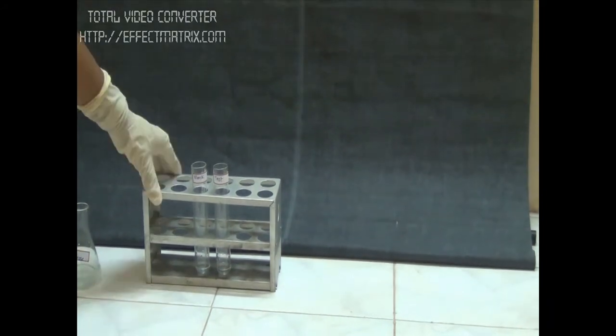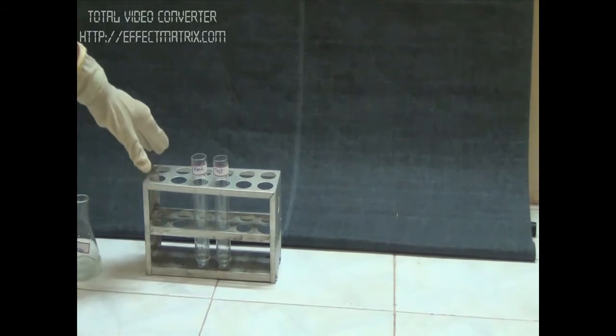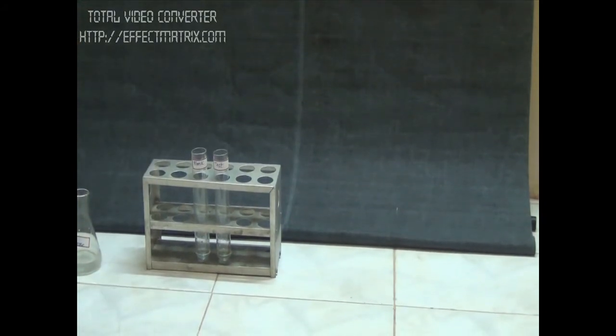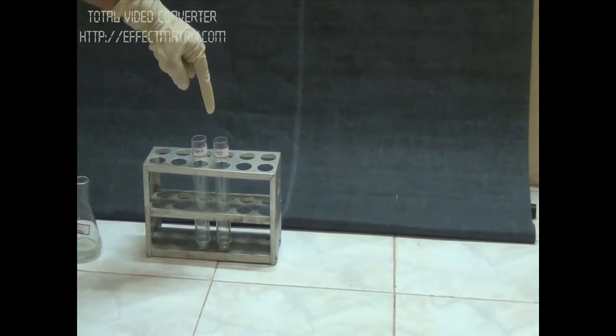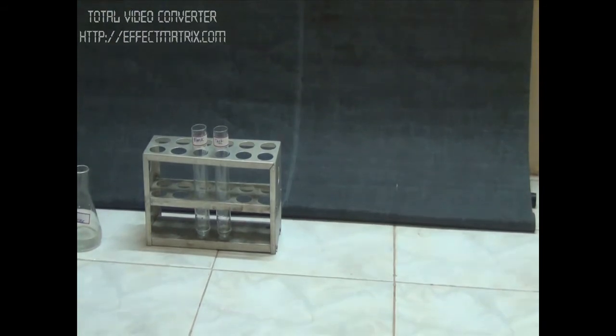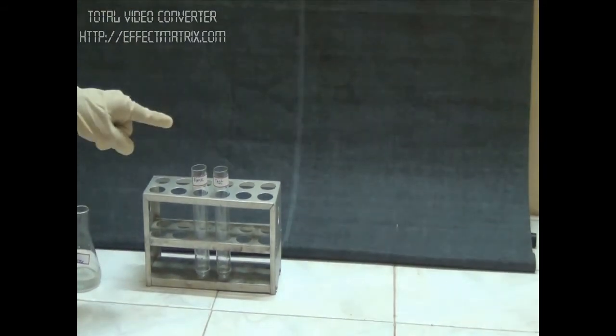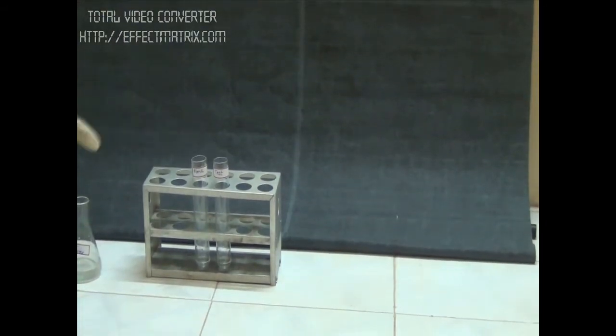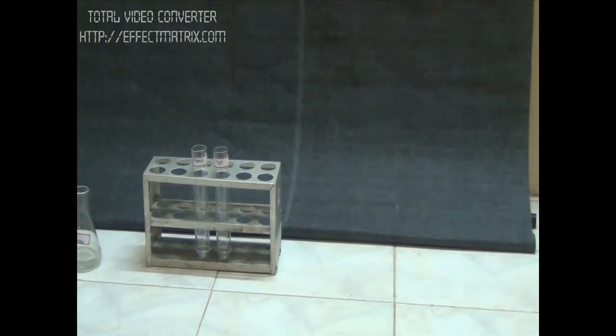When the tubes are incubated for 15 minutes at 55 degrees, the test tube will have fructose and glucose as the enzyme does its work. The blank tube, without enzyme added, will have unchanged sucrose.